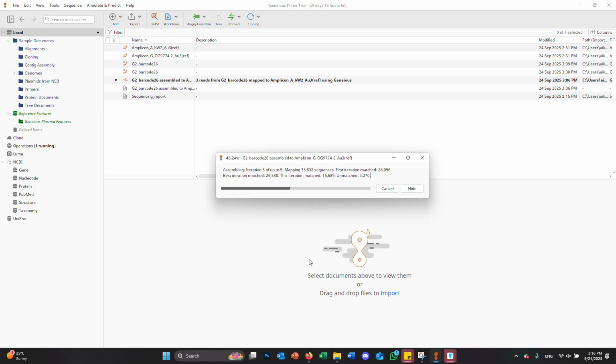If you want to do some more hardcore phylogenetics, you probably should do the evolutionary biology unit in first semester. You've probably been shown how to make a real tree in that unit, I'm guessing. But for today, that's all we need. We just need a quick tree. And then you can look and see what your consensus sequence matches to the most.